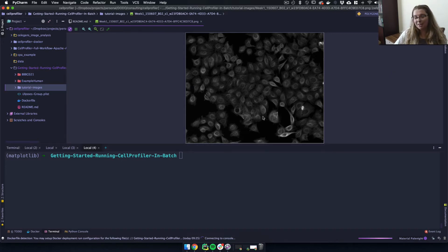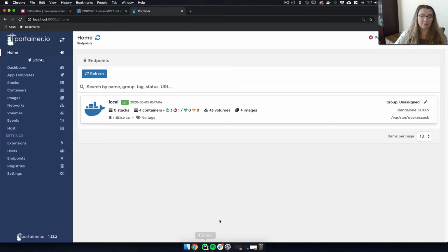This is one of the images. Isn't it nice? I like cell images. I think they're very pretty.